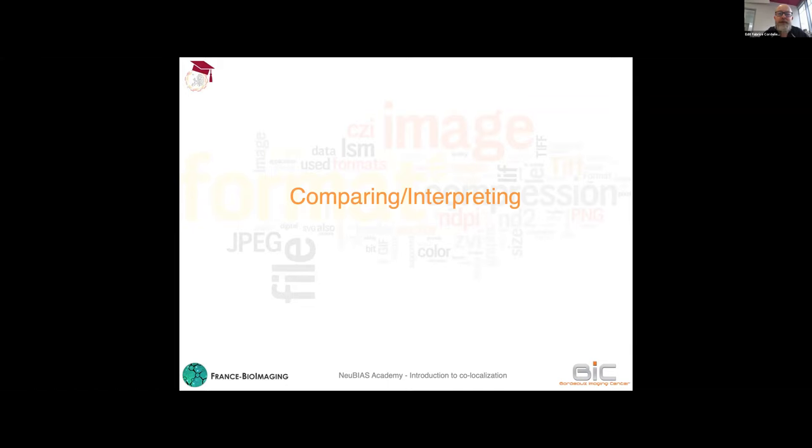I refuse to give you advice on the tools, because there are many out there, and many that are really good. It all depends on your full workflow and how you can integrate and jump from one tool to another. Maybe you want to get stuck into ImageJ, or maybe you want to go to ICY. In that case, explore what is there and have fun.